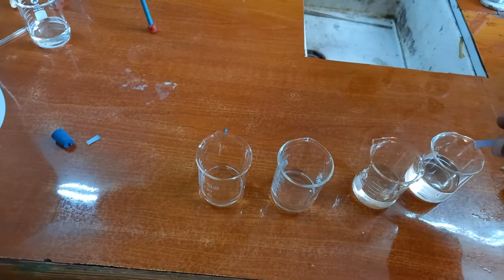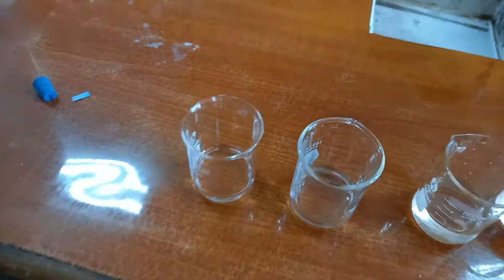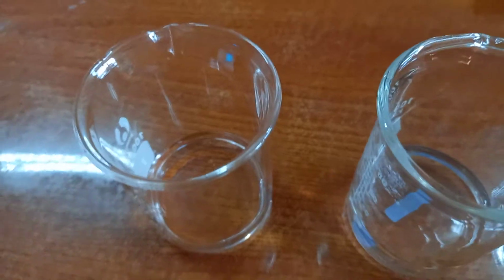So this is ethanoic acid. It changes it to red. This is the aldehyde. It changes it to red. That is the ketone. It is still blue. And the alcohol is blue.